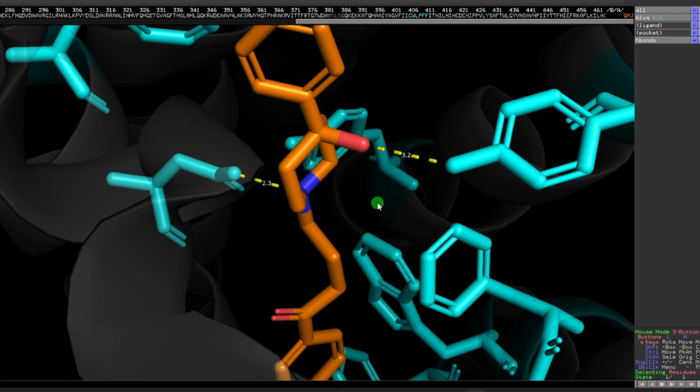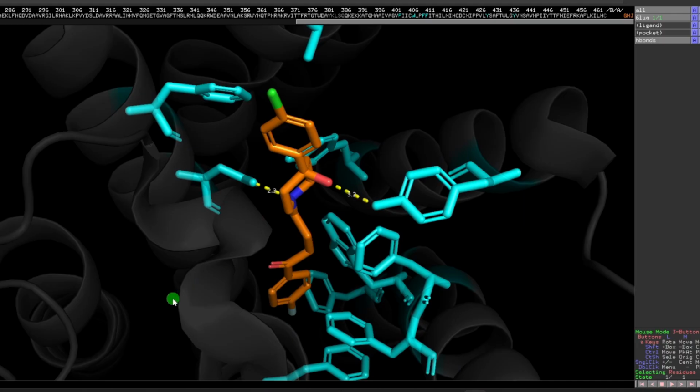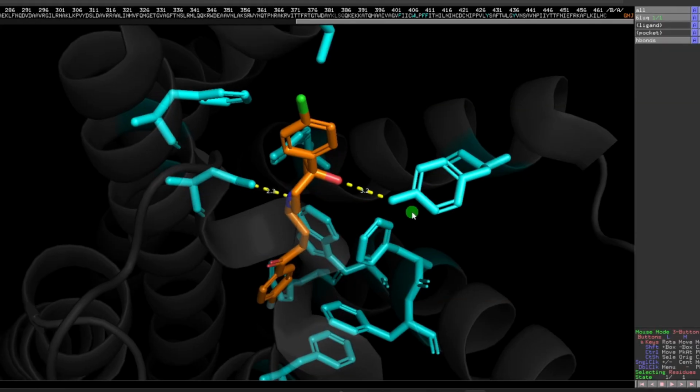In this one, we will be focusing on ligand and protein interaction. For those who are not aware, ligand and protein interaction is the interaction of a protein molecule with its drug molecule. Most of the time, journals ask for this interaction in the form of a 3D image. In that, you show the ligand and the interacting residues in the protein, along with information such as hydrogen bonds and the residue names. You can create a wonderful map that will be appreciated by reviewers.